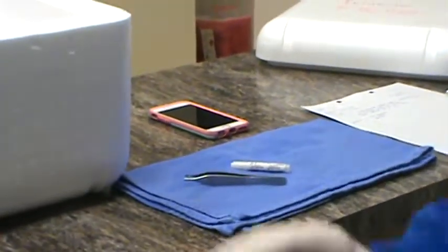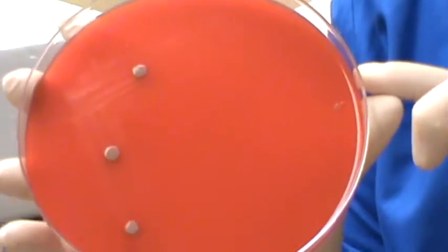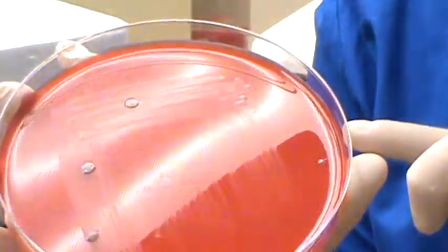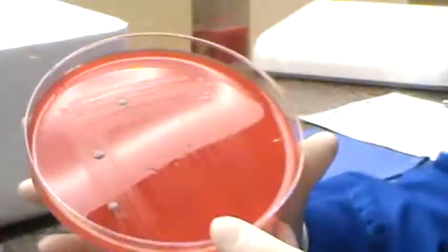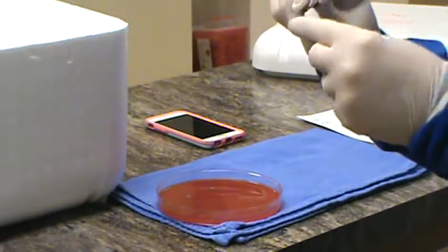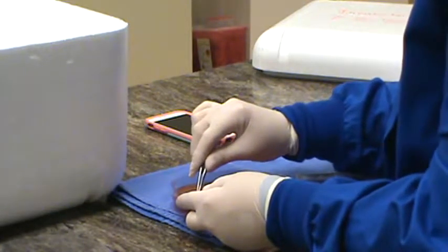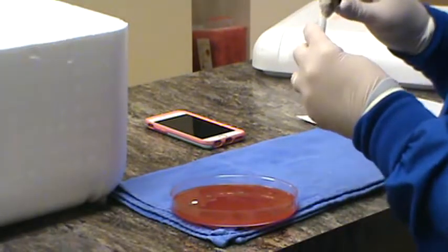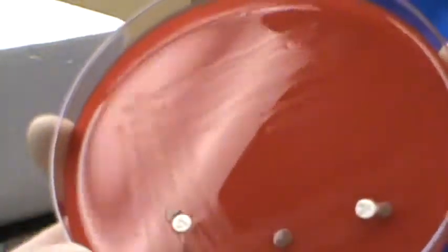So I'm going to take out our plate. We're 24 hours later, and the growth on our plate is not real interesting, but we do have a little bit of growth there. You can see here where it's been incubated. There are some little spots there and one out here. So I'm going to add some of those antibiotic discs to the plate. Okay, so we added a couple of those antibiotic discs. I'm going to close it up and re-incubate it and check on it when it is finished.